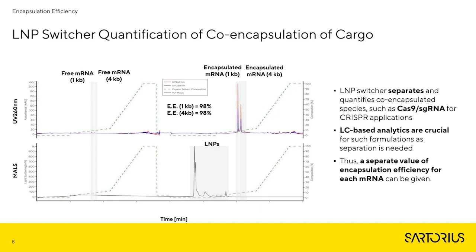And then very important in applications for gene editing, like Dan described before me, for CRISPR applications, where you need to separate away at least your Cas9 mRNA and your small guide RNA. That is possible to do on a setup and with a chromatographic approach.